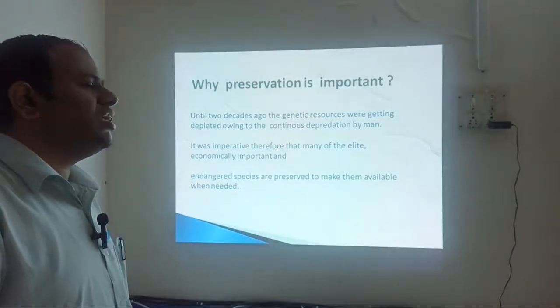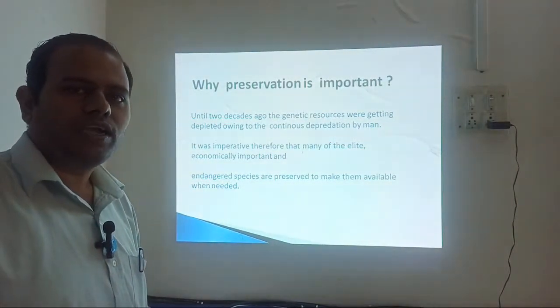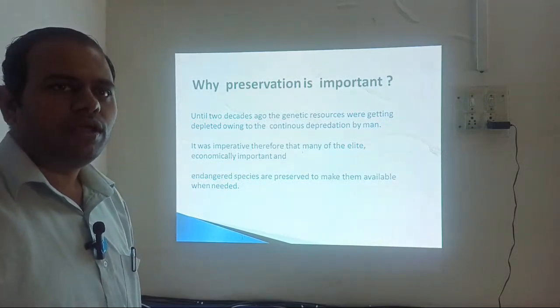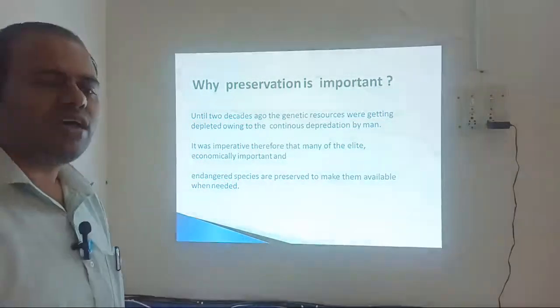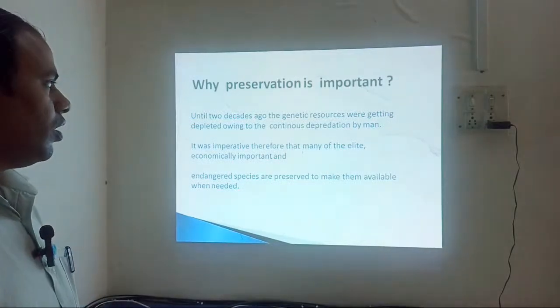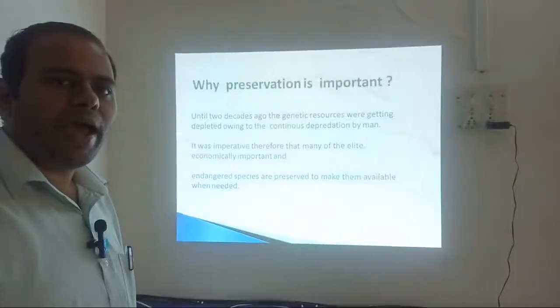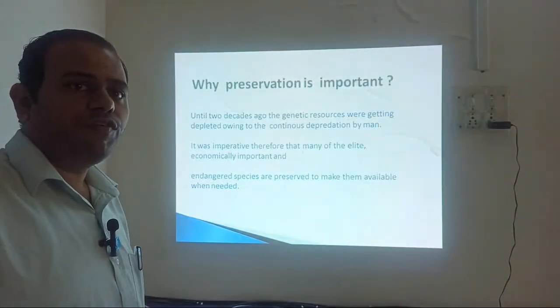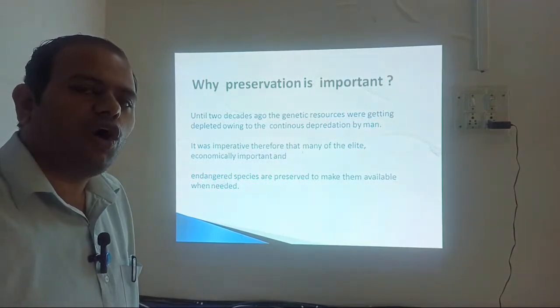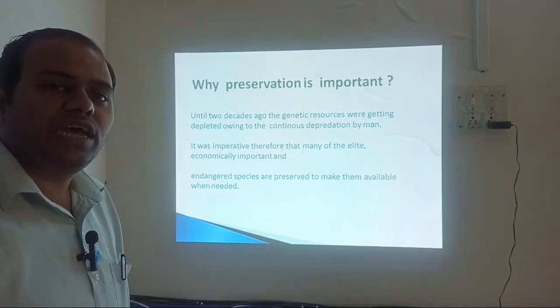So why is preservation important? Whatever the material, whether an animal tissue or a plant tissue, if you are not preserving it, it will not remain as it is for a longer time. Preservation helps in maintaining the original state of that particular tissue for a longer time. Preservation techniques have been used by mankind for a long time. An ancient preservation technique is one in which bodies of man and animals were preserved in formalin in Egypt, in the form of mummies.